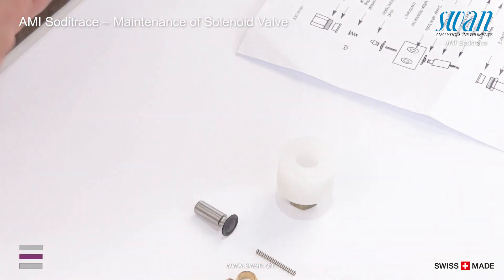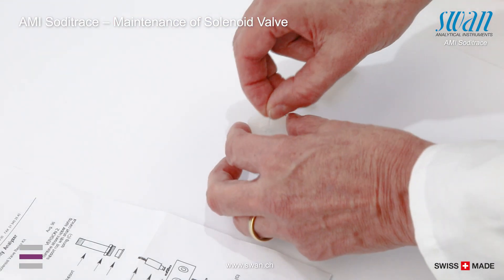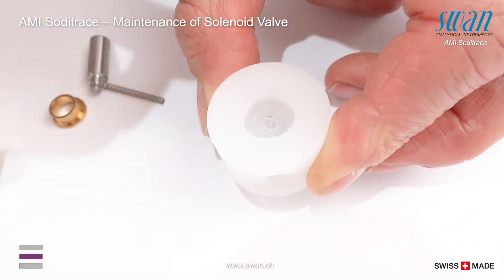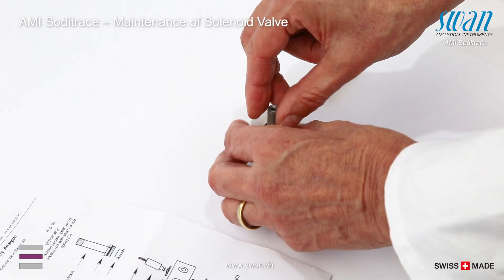Turn the valve body upside down and place the teflon distance bar in the center hole of the valve body. Place membrane two with holder in the valve body.